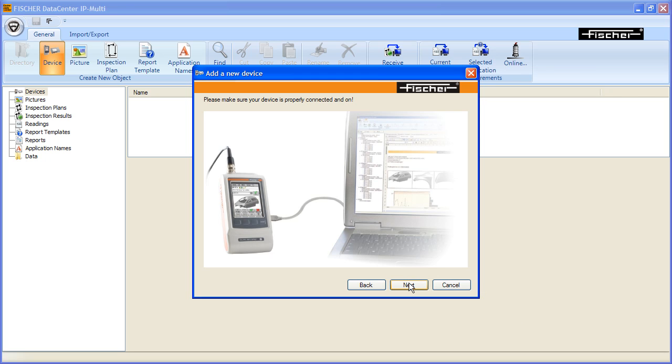Verify once more that your Fischer device is powered up and connected. Then click the Next button.